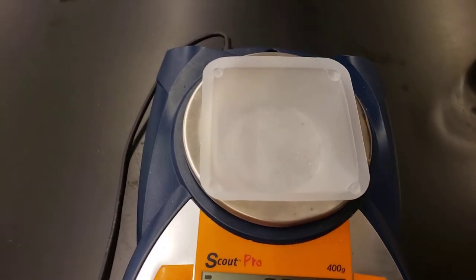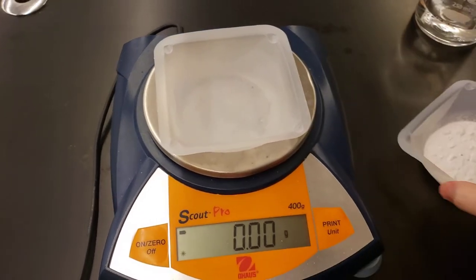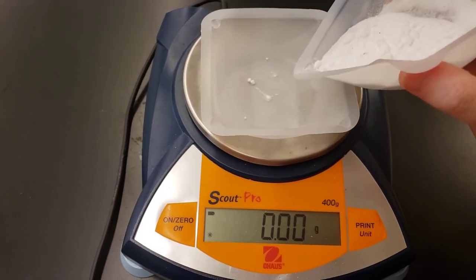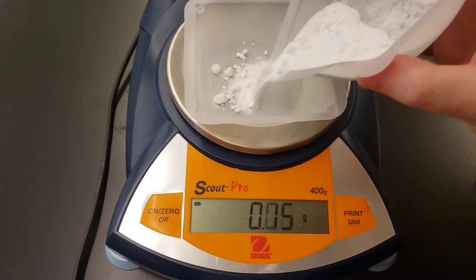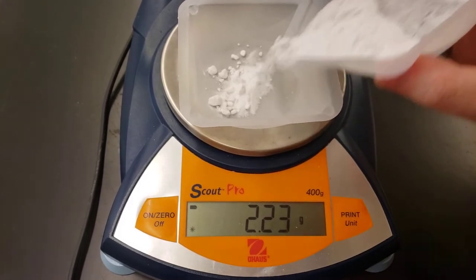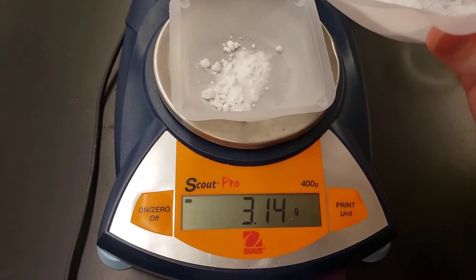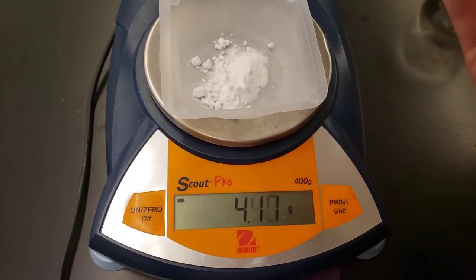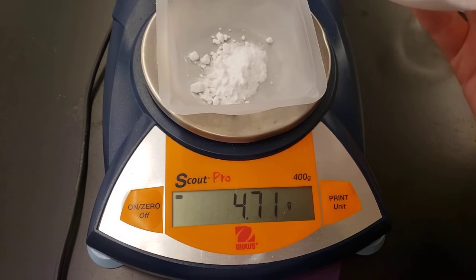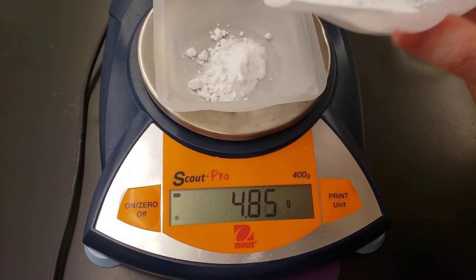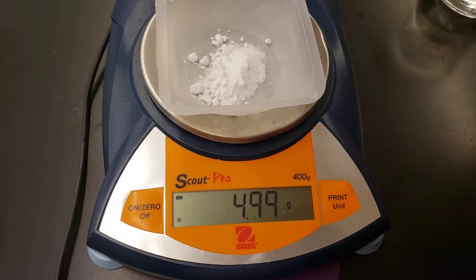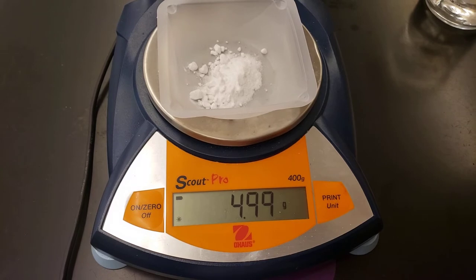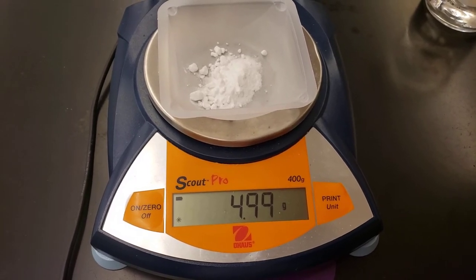Then I'm going to take my baking soda and I'm going to add baking soda to the weigh boat until it weighs approximately five grams. Once again we are adding in small amounts to make sure we don't go over. I think that's about as close as I'm going to get so we are going to write down 4.99 as the amount of baking soda we are starting with.